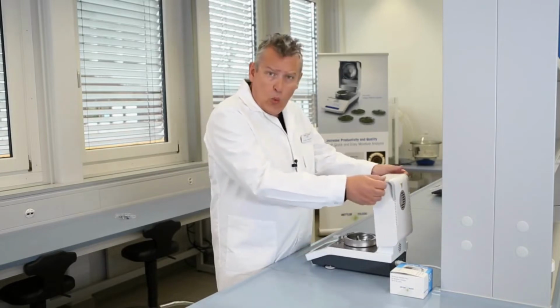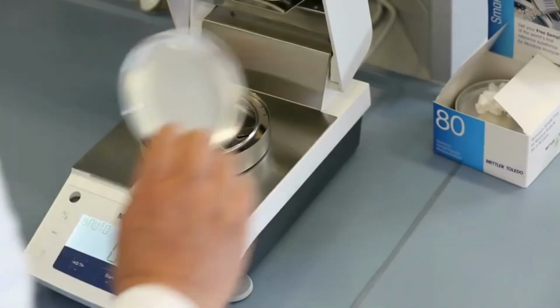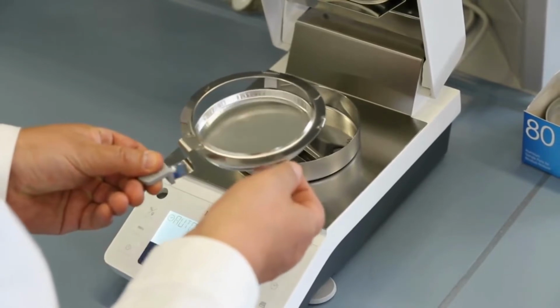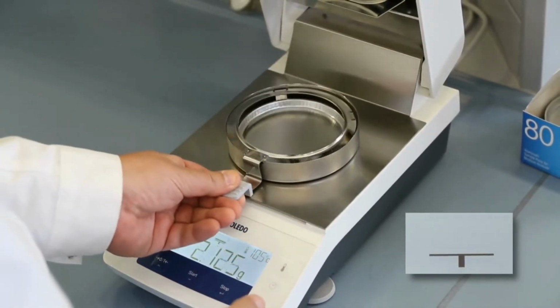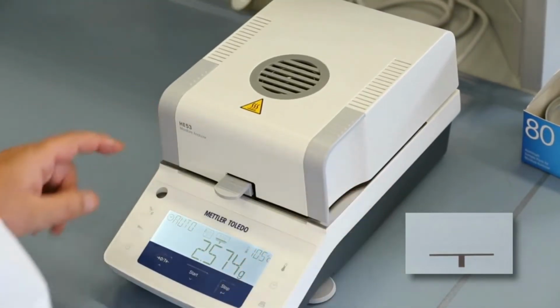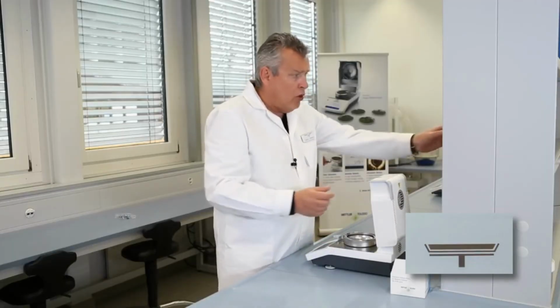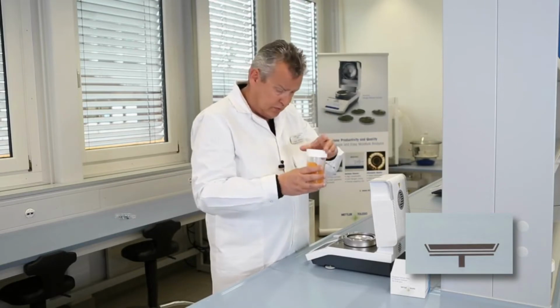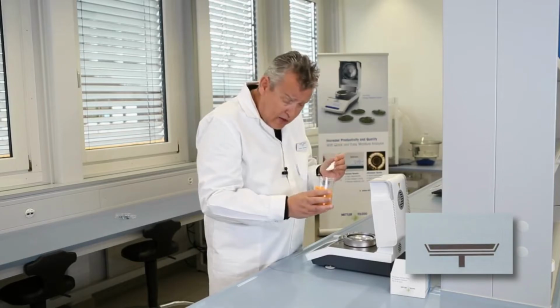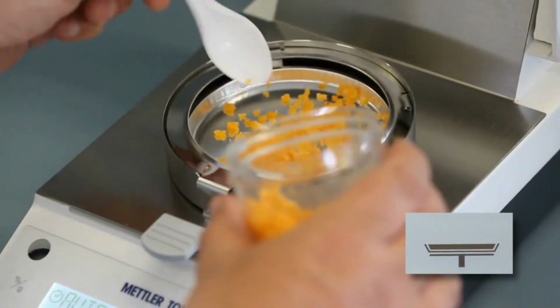First of all, we need to place the aluminium sample pan in the pan handler, place the pan on the weighing pan, and then close the lid. Now we need to tare the empty pan. We now open the lid. We take our sample. And we now need to weigh in and distribute the sample on the aluminium sample pan.